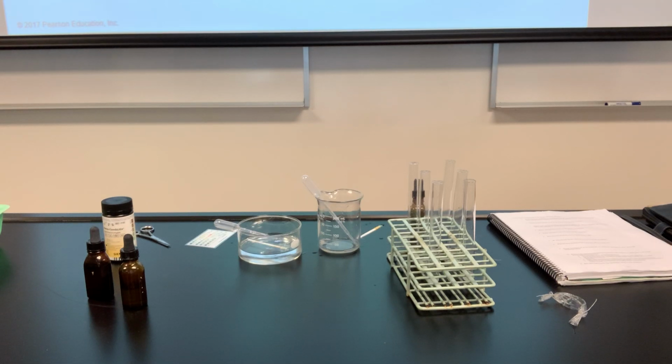Now, one more thing, because I'm noticing this happening. If you are cleaning the lenses with the lens solution, do a final drying with a dry lens paper, okay? So it doesn't smudge the lens. All right, let's go for it. The pipettes can go in the biohazard bag. If you use gloves, biohazard bag. Let's clean up, please. What about the biohazard bag? Yeah.